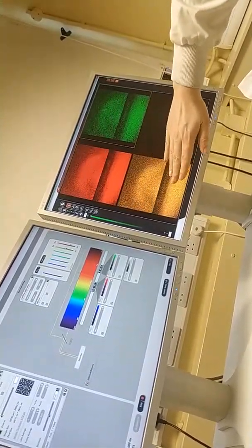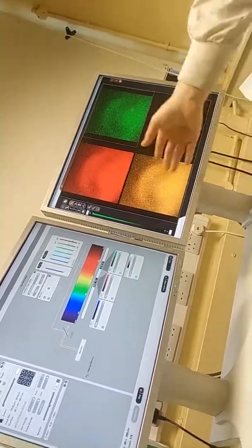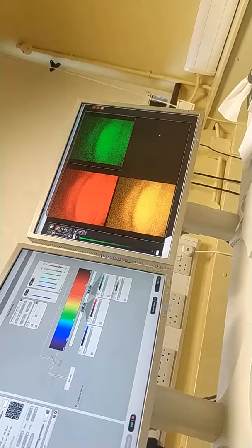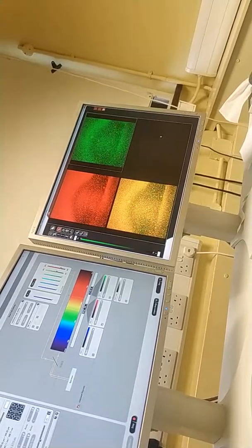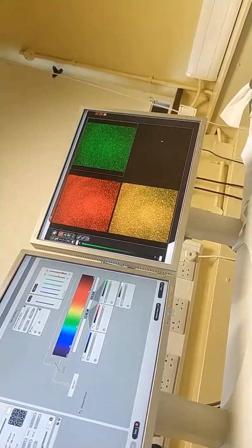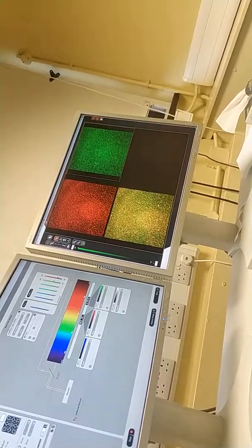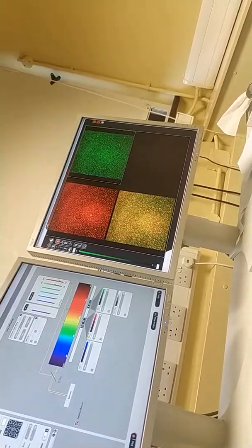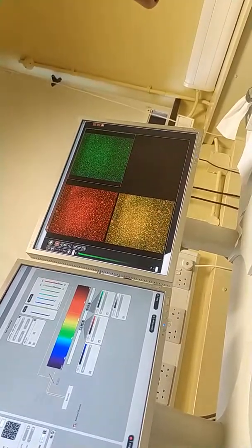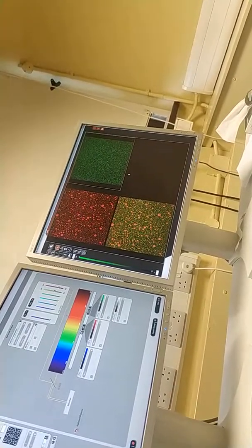It is good to go a little bit, penetrate a little bit in the sample, because the cover slip will give some reflections like this. This is just reflection in the cover slip. So if you go a little bit deeper, you will start seeing structure. But this is a little bit saturated. You can decrease the gain if you want, but you still see some reflection from the cover slip, so I would go a little bit deeper even, and at this point we can clearly see just the sample. You see the difference.